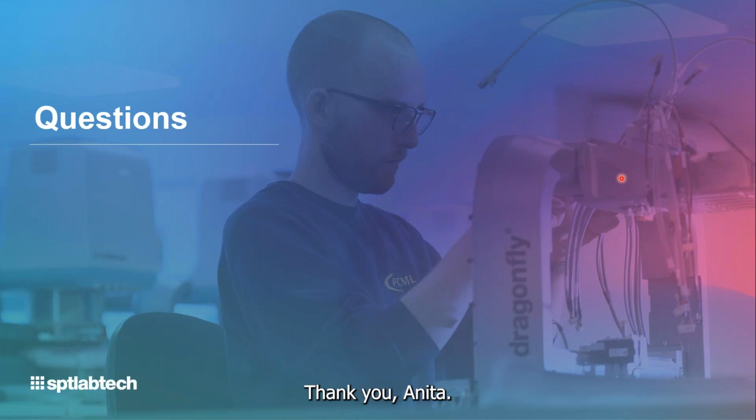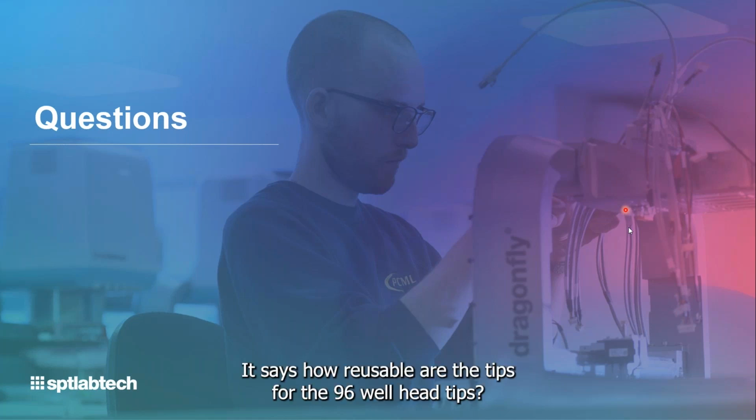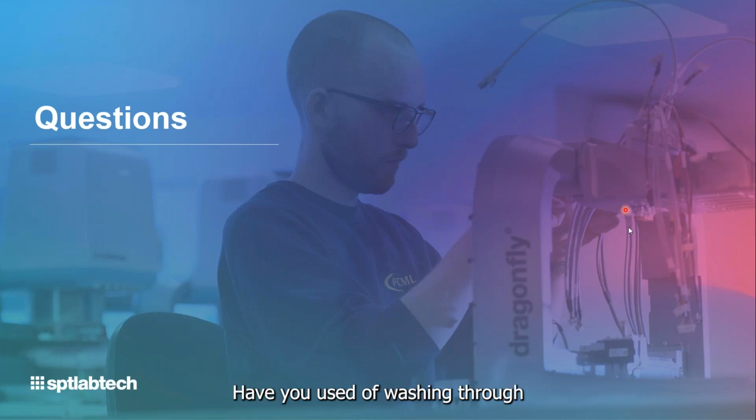Thank you, Anita. Well, let's see. I think we can squeeze in one more question. It says, how reusable are the tips for the 96 well head tips? Have you used a washing through or cleaning tray?